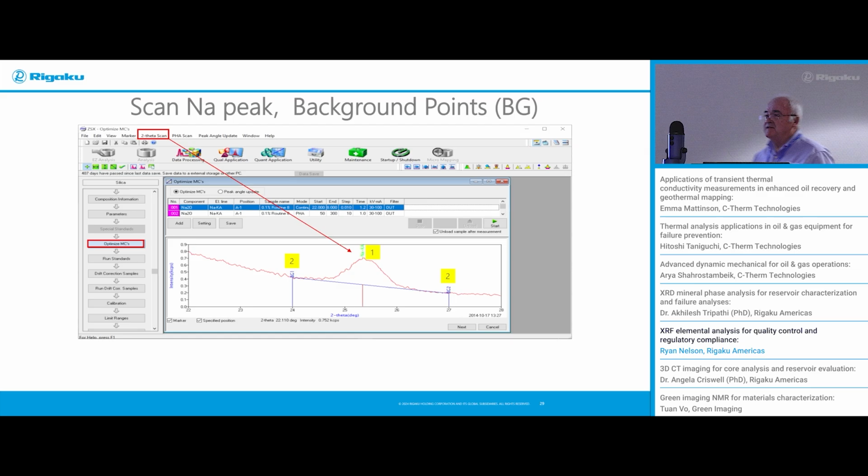PHA and background, so this is some of the settings. Of course, this is a slope, typical slope or horizontal. You'll have to select two backgrounds for intersect with the net. Typical setup in the software. So what you do in any case when you're optimizing something is backgrounds for trace, peak angle, and overlaps, and time. So that's true for any X-ray. So all of this is automated in most systems. So this will give you the best accuracy down to trace level measurement.